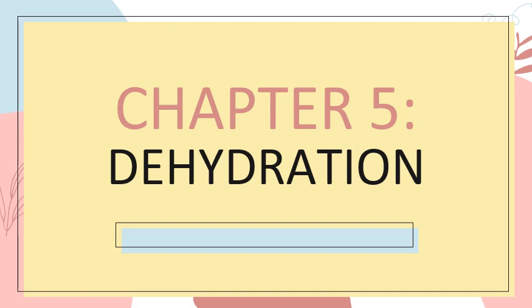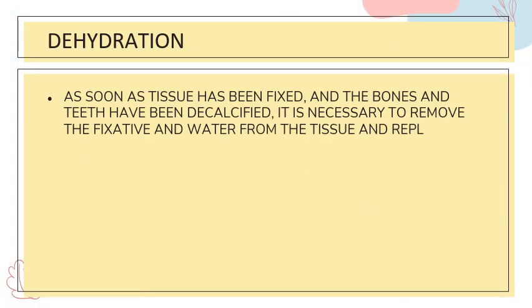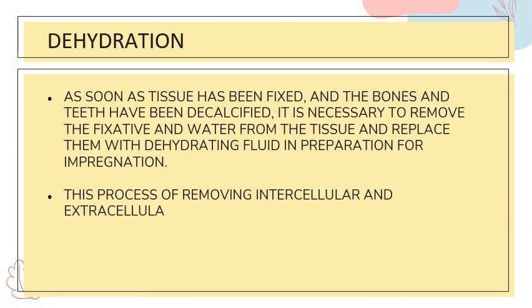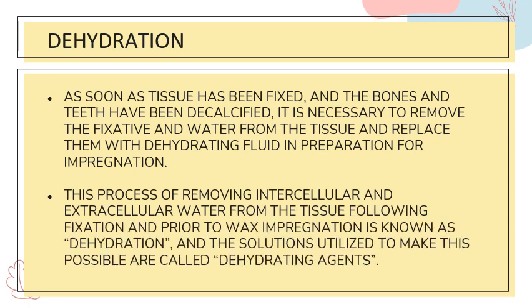So today we will discuss dehydration. As soon as the tissue has been fixed and the bones and teeth have been decalcified, it is necessary to remove the fixative and water from the tissue and replace them with dehydrating fluid in preparation for impregnation.